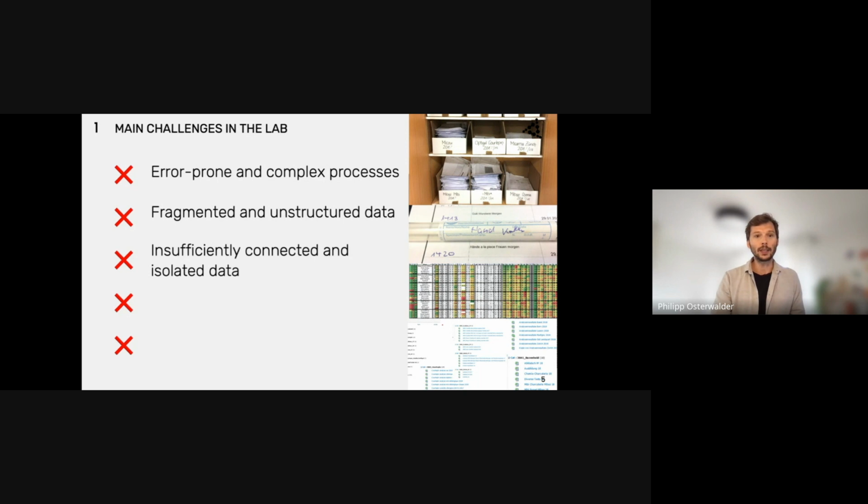The next point is siloed data: insufficiently connected and isolated data, where a variety of different systems can be used as a single source but are not connected. This makes it difficult and requires a lot of skills.